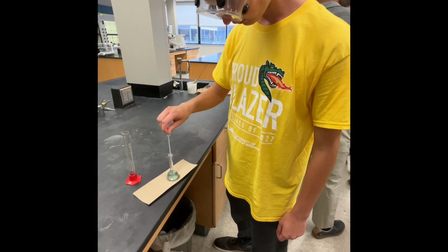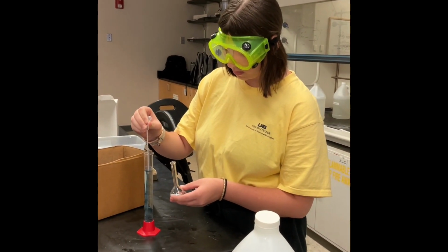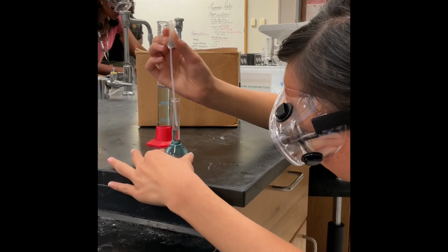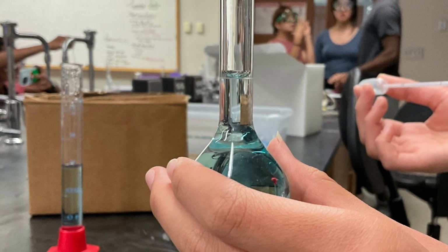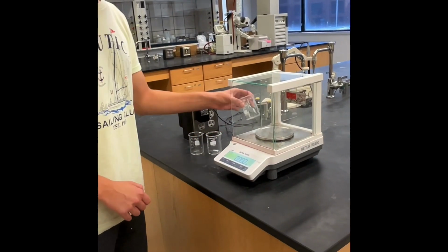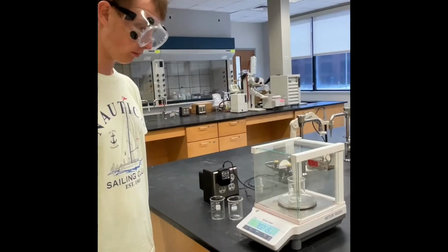We can double check our volume by measuring the bottom of the meniscus created by the liquid inside. The meniscus is a curve in the surface of a liquid solution when it touches another material, which is created by polarity. For example, water molecules are attracted to the molecules on the wall of a glass beaker, but the water molecules are also attracted to each other and tend to stick together. When water touches the glass, it pulls the additional water molecules up along the wall of the glass, creating a small dip in the center, which is the meniscus.